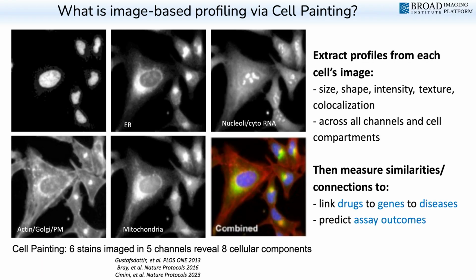So just one preview here, since we mentioned cell painting, about what cell painting is, right? So those who maybe have some biology background, who maybe biologists, might wonder, like, right, so you're going and imaging these cells, you're marking them with these dyes that you told me about. What are these dyes? Like, you're not looking for any specific signaling pathway, you're not looking for a protein, you're looking for like global structure. So what do you mark, right?